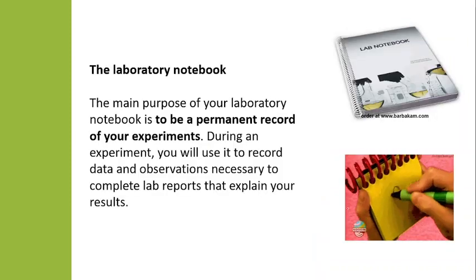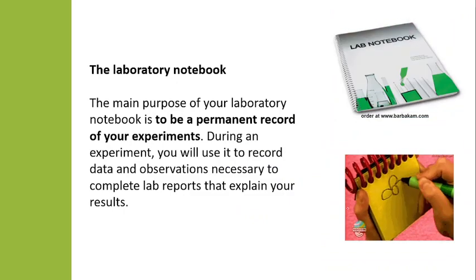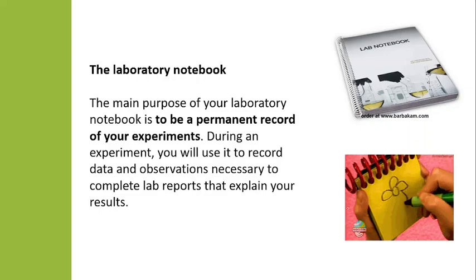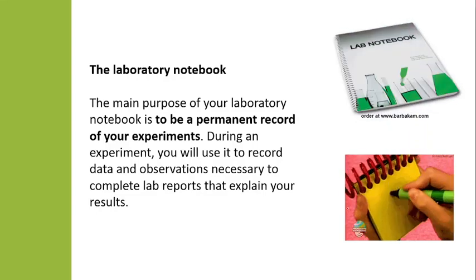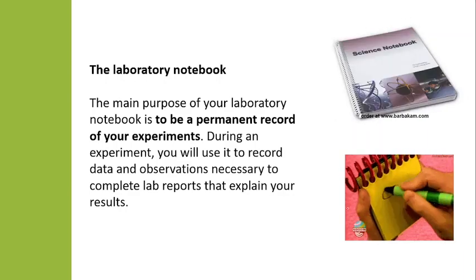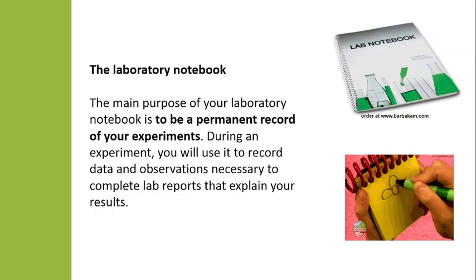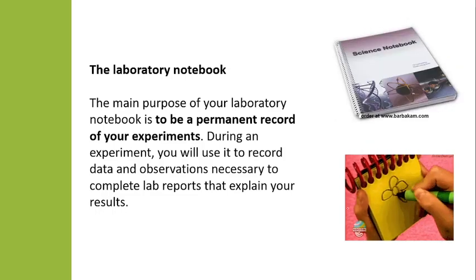Next are your laboratory notebook. The main purpose of your laboratory notebook is to be a permanent record of your experiments. During an experiment, you will use it to record data or observations necessary to complete lab reports that explain your results. So in a face-to-face setup, we can make use of your laboratory notebook or your laboratory manual to record the data that has been observed.